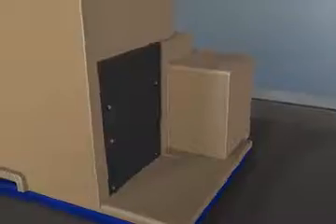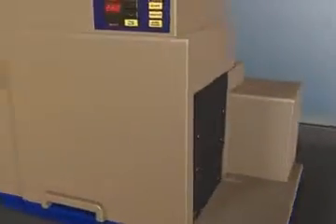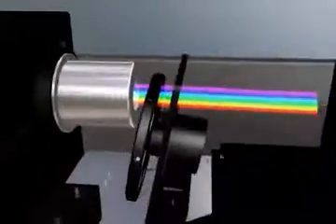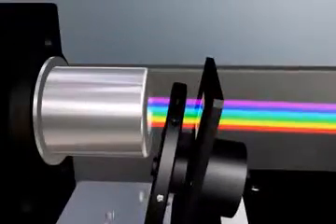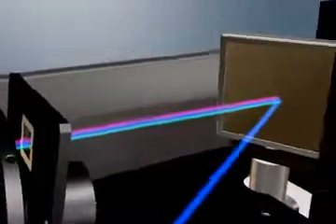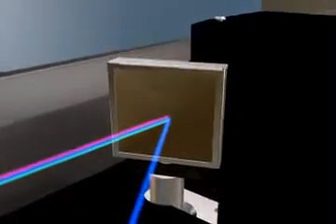The FlexStation 3 system is based on the SpectraMax M5E multi-mode reader and uses monochromator-based smart optics to select the desired wavelengths for your assay.